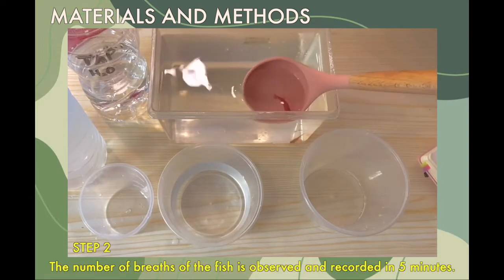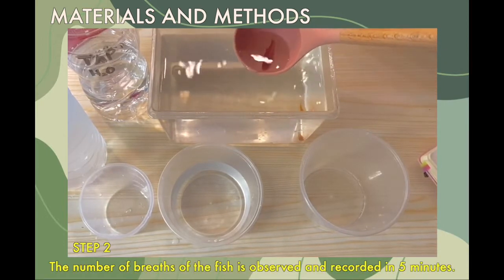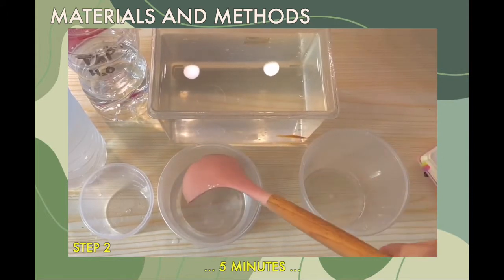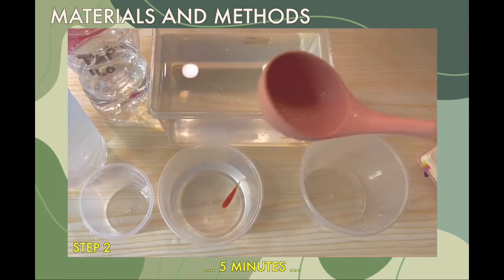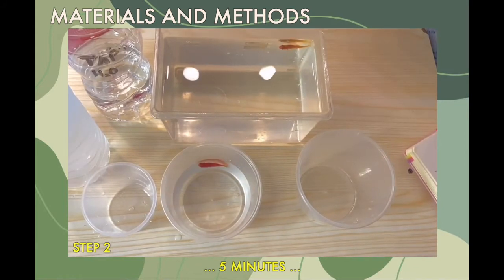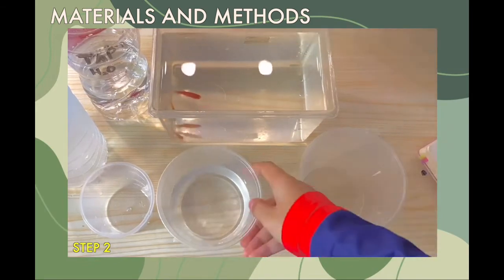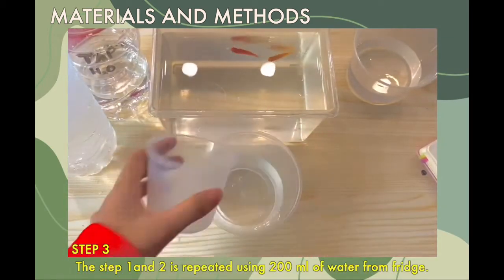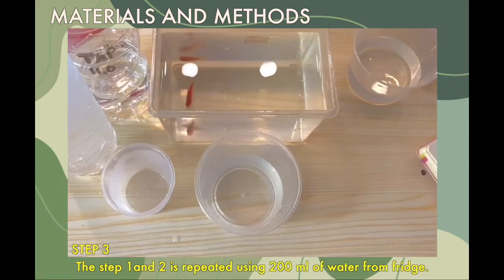The number of breaths of the fish is observed and recorded in 5 minutes. Steps 1 and 2 are repeated using 200 ml of water from the fridge.